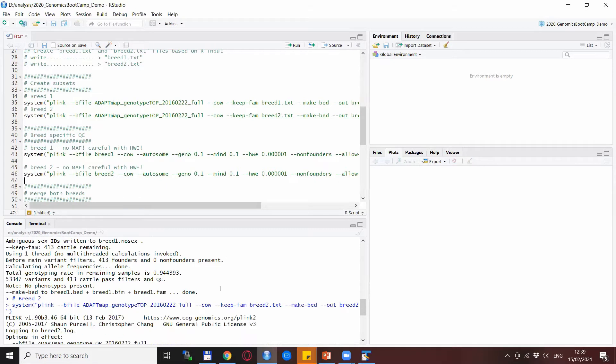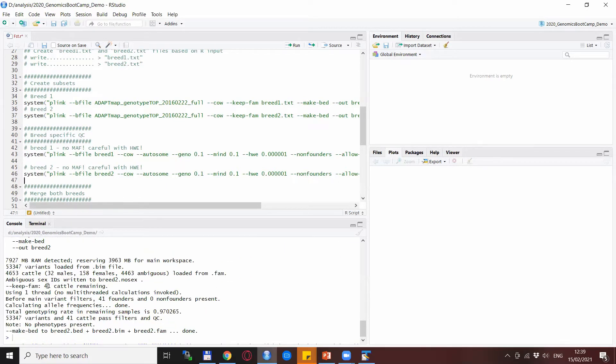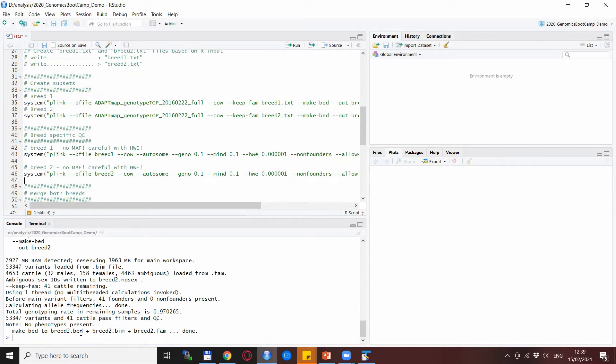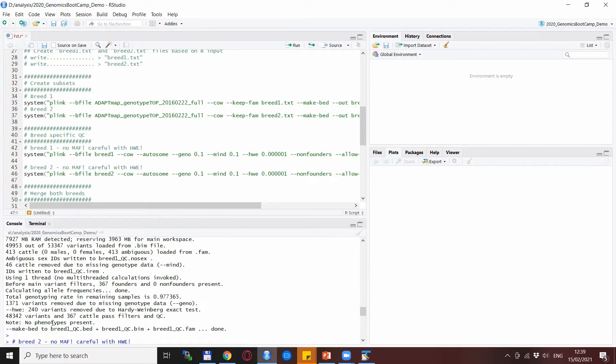The second breed is the Gumus goats. There are 41 of them, and we don't do any quality control at this point. After the quality control, we see that we remove about 46 goats because of missingness and about 1,500 SNPs because of various reasons—missingness or Hardy-Weinberg. After keeping just the autosomal genome, we are ending up with 48,000 SNPs and 367 animals.